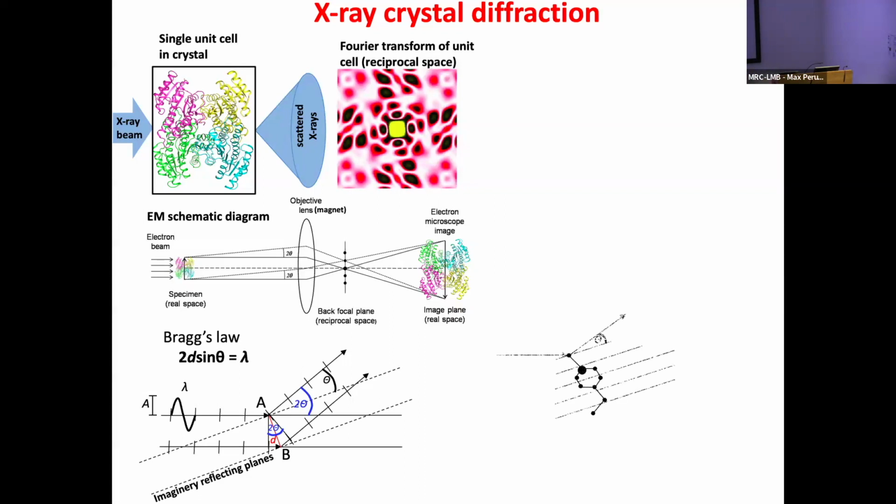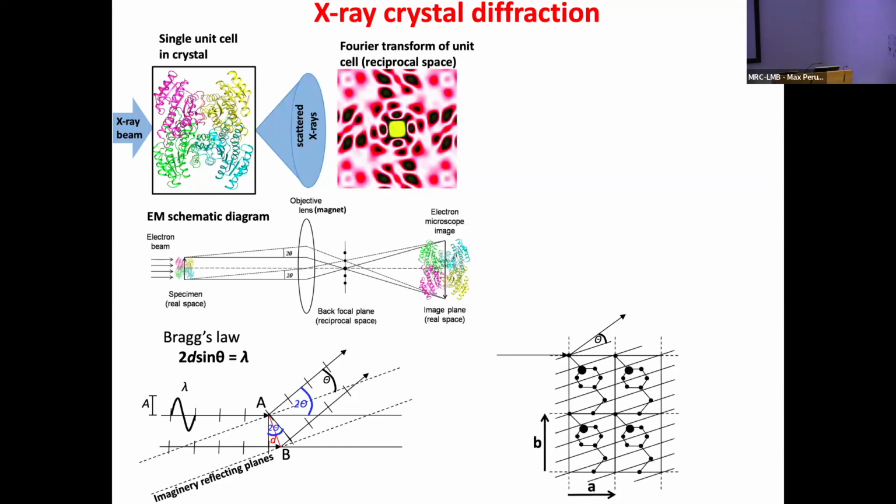Now, in crystallography, it turns out that these planes, the interacting ones, the ones that give you amplification of the signals, are only those planes that cut your unit cell that we've seen before in integer numbers, okay? So if the planes cut, like in this case, four times, it means it's going to give you constructive interference. If it was 3.5, and then it was only half, it would be non-constructive, so the signals will just cancel each other out.